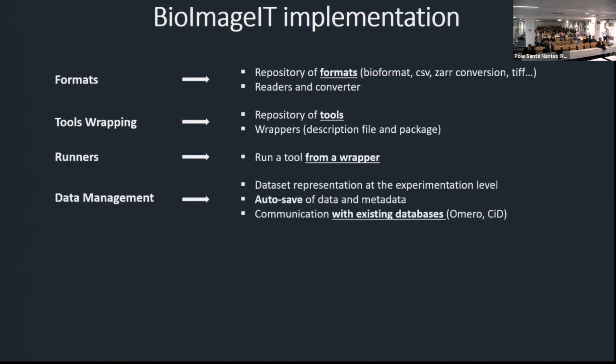The data management part: the datasets you import in BioimageIT are represented as experiments. I said it auto-saves the data and the metadata, and it can communicate with external databases such as Omero or CID.